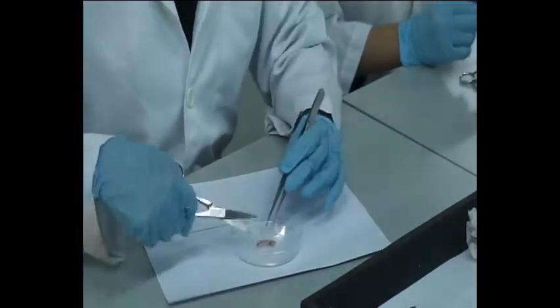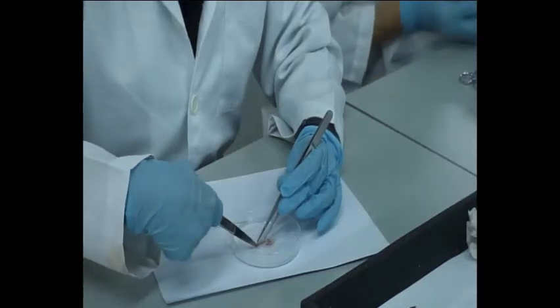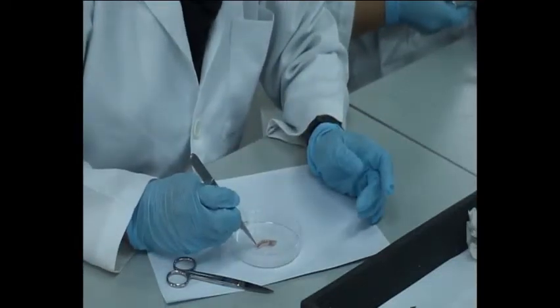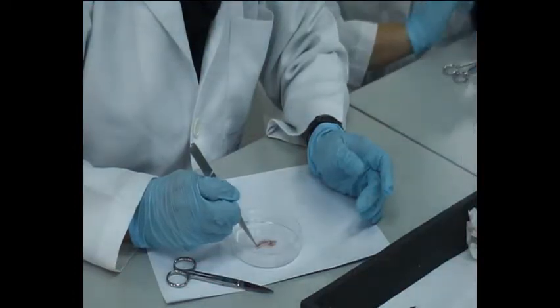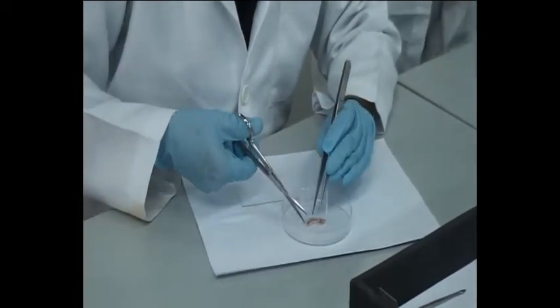Then for the last method, pick up one gill filament using forceps. Then with a pair of scissors, cut approximately 5 millimeters in length and put it in a drop of distilled water on the glass slide. Gently cover the filament with a cover slip. Then you need to observe, draw and label the structure of the gill filament.